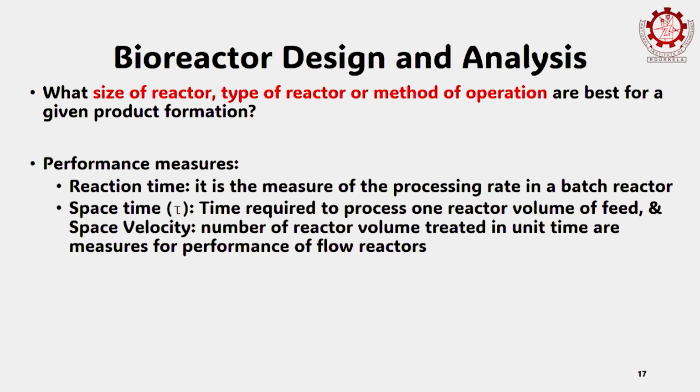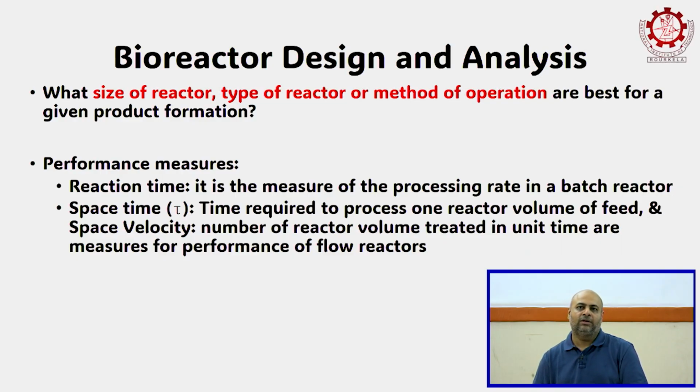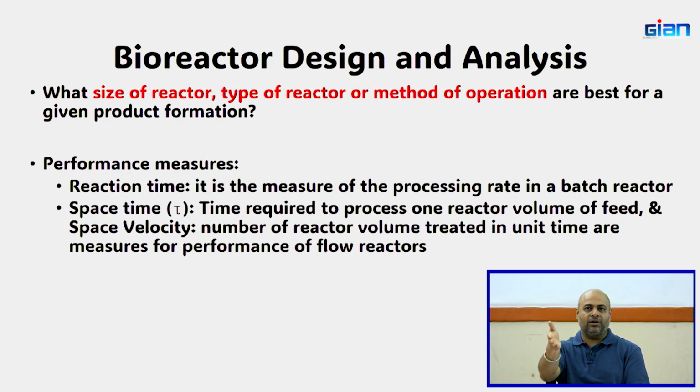Okay, so bioreactor design analysis. What size of reactor, type of reactor, or method of operation is best for a given product formation? That's the very first question that you're going to ask yourself when you're trying to choose the type of bioreactor for your own process. Now it very much depends, for your own case studies, on the type of product that I have asked you to make.